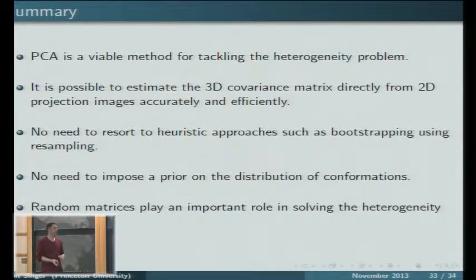And the last part is that random matrices play an important role in solving the heterogeneity problem. And characterizing these distributions can give the biologists and the microscopists tools to actually understand how many different structures are in the data.